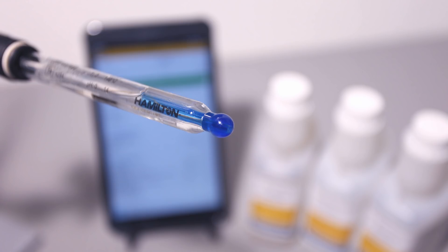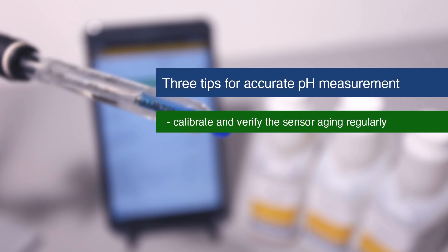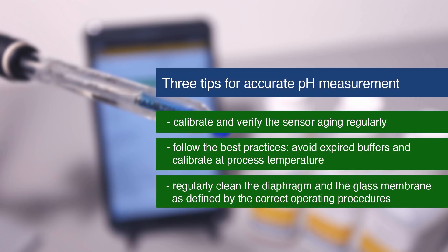To ensure that your pH glass electrodes deliver accurate measurements, appropriate handling and maintenance is necessary. The three most helpful tips to achieve this are: calibrate and verify sensor aging on a regular schedule; calibrate using best practices like avoiding expired buffers and considering the effects of temperature during calibration; and regularly clean the diaphragm and glass membrane based on process conditions.